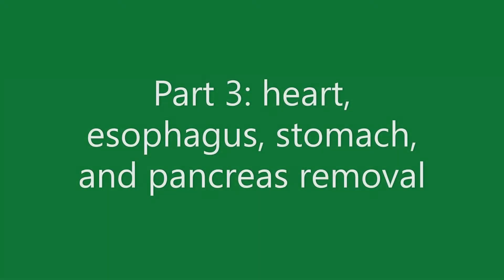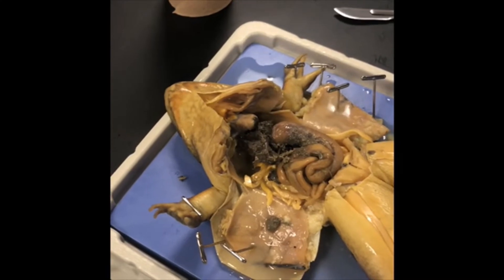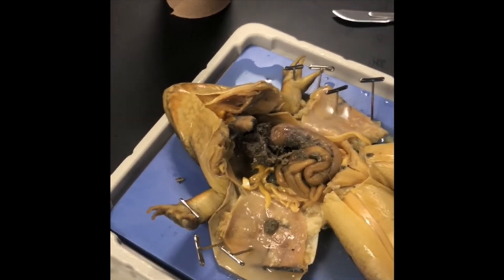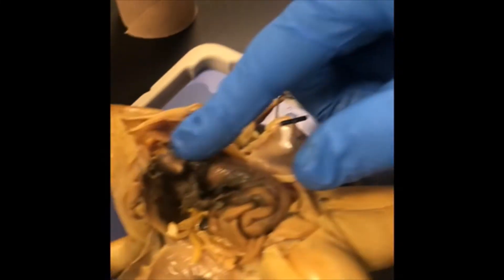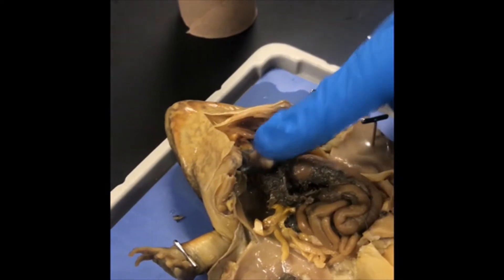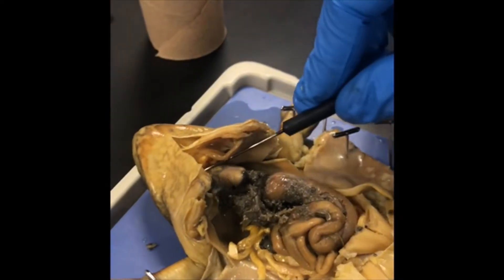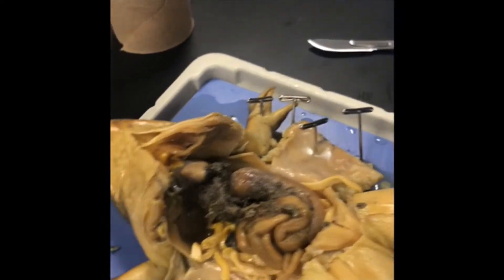You're going to identify the heart; it's going to be covered by a membrane. The heart consists of a single thick-walled ventricle and two right and left anterior thin-walled atria. With forceps, lift the heart, cut it, and put it on your placemat.